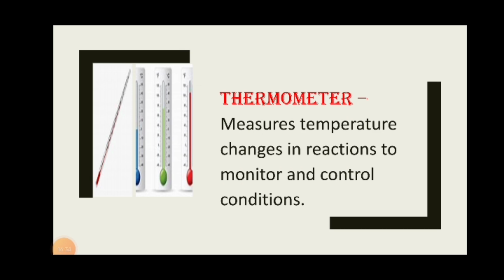Have you observed ang colored may red, no? Na ang very classical, yung pinaka luma is silver, that's mercury, but due to its toxic because accidentally if the thermometer will break, no, and land in the ground, will breakage siya. So there's something kinds of toxic level sa iya.